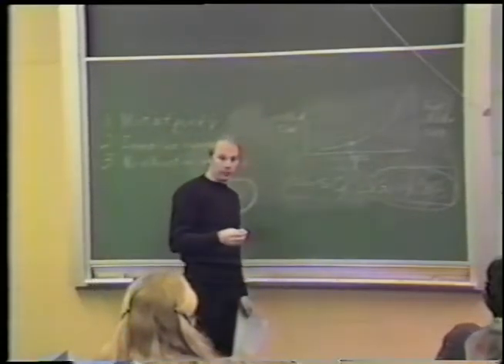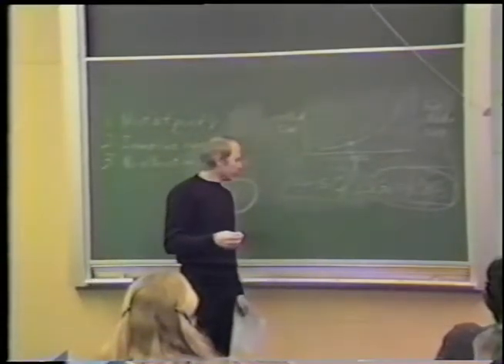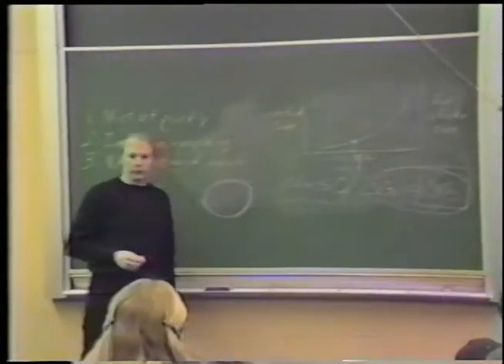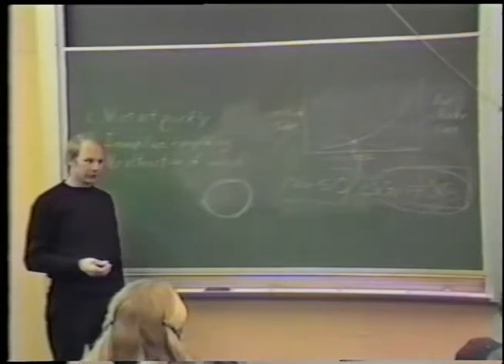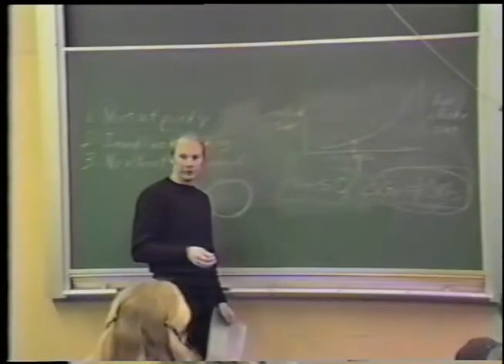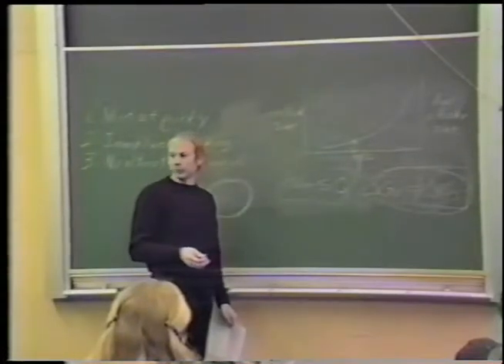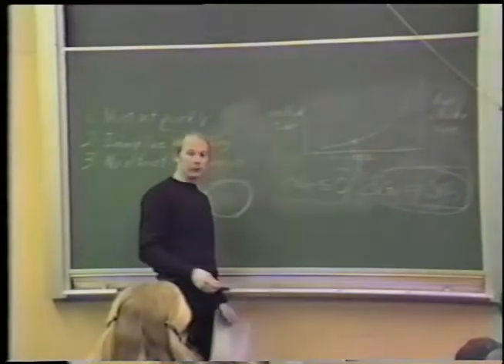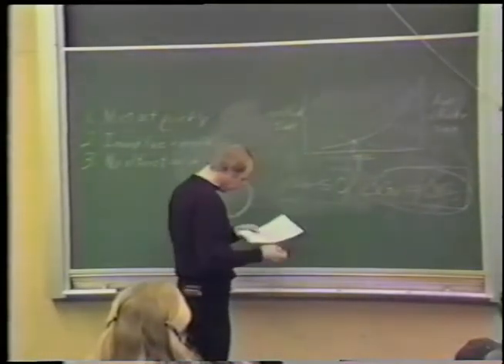Get it there or below. And then once water molecules begin to add to the nuclei and release the heat of fusion, you have to keep the system at or below that temperature, so you can keep the rate of formation of nuclei high. That way you get the maximum number of nuclei, the smallest ice crystals, and the least damage to the specimen.